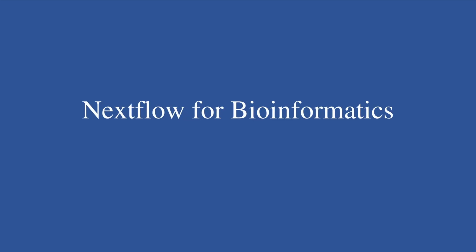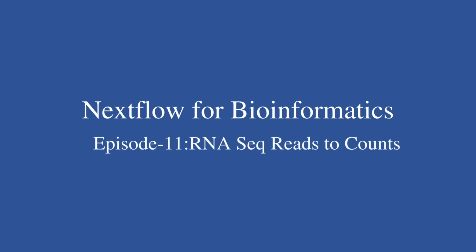Hi everyone, welcome to another Nextflow tutorial for bioinformatics. In this video, I'm going to give you a script that you can use to generate your RNA-seq read count.